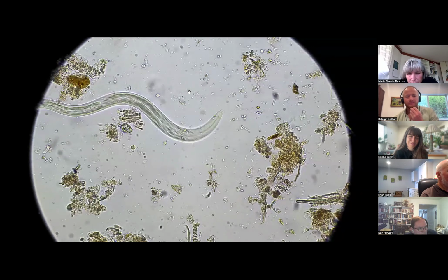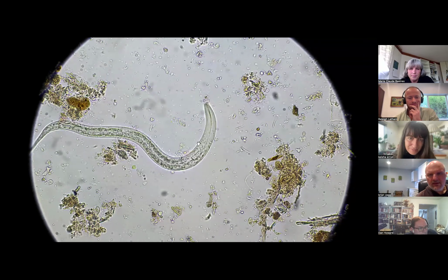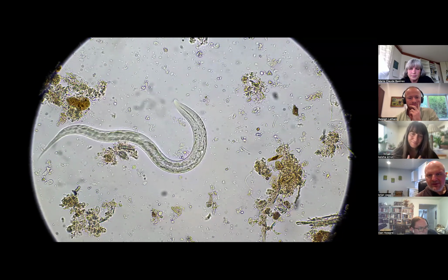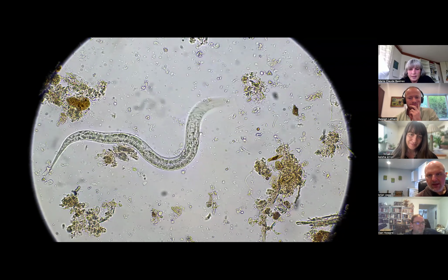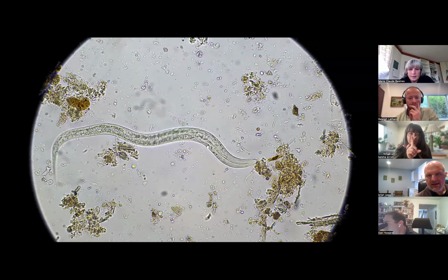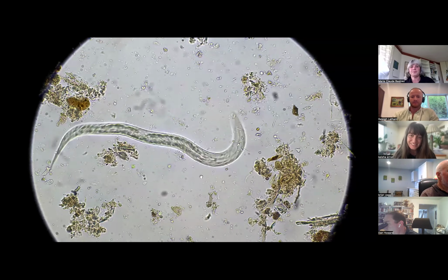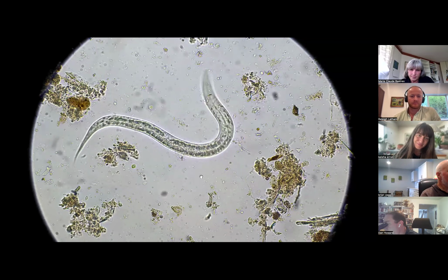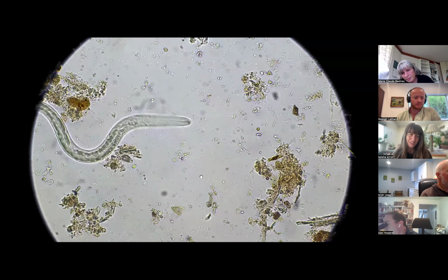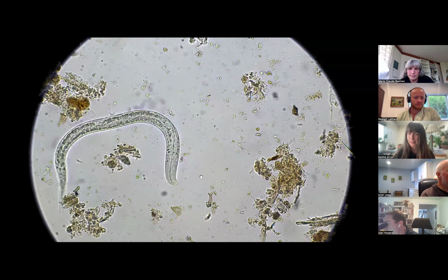If you look about a third of the way down, there's a cuticular valve, right in this area. And watch, it's pumping away. You can see it moving, just pumping away as it's consuming and eating bacteria. Can you guys see its mouth too, that perfect little V? It's got that skinny, narrow mouth. So yeah, I'm happy. A lot of good diversity of nematodes in the vermicompost as well.